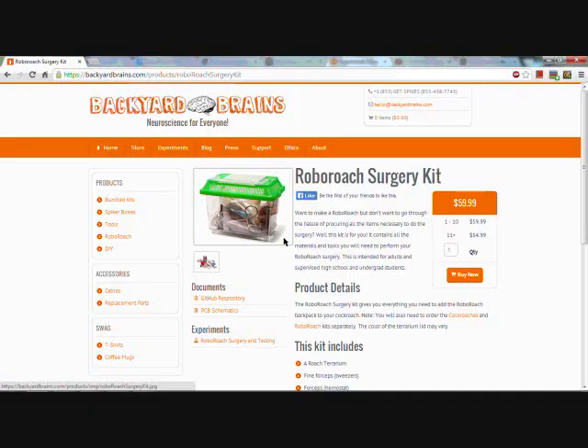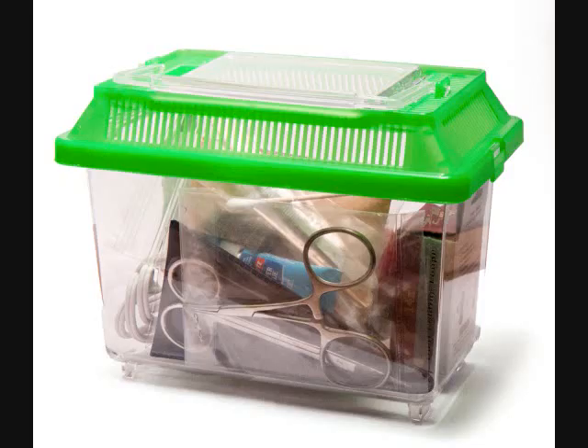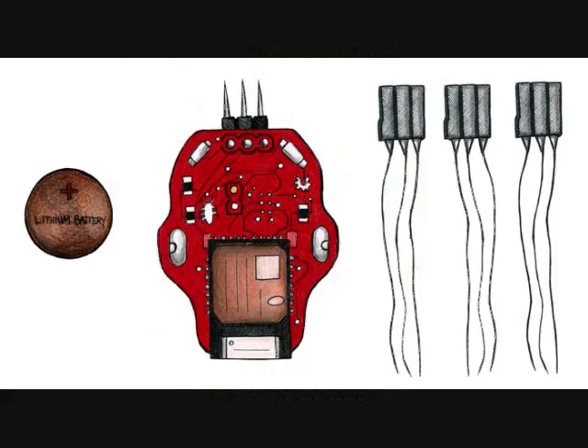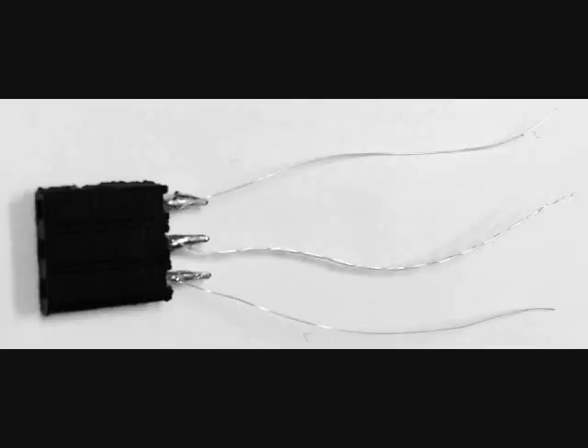Feeling confused on how to procure these tools? We've made it easy for you with the RoboRoach surgery kit, which includes all the equipment you need, plus a terrarium to house your cockroaches. You will also need an adult cockroach, also available through the Backyard Brains web store. In your RoboRoach kit you will find the two-channel microcontroller, a coin cell battery to power it, and three sets of electrodes. Having three electrode sets means you can try the experiment three times, and extras are available in our web store. We've also created build instructions if you'd like to learn how to make your own. Set out one electrode array for this experiment.